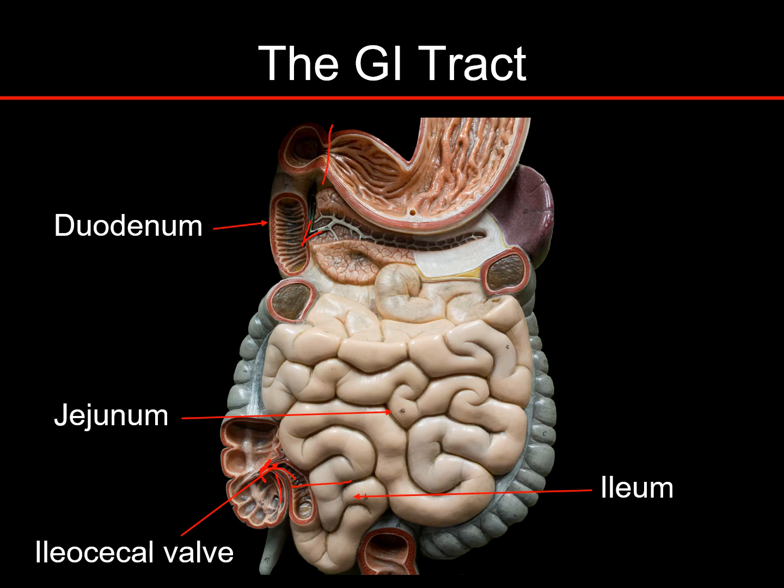Okay, so here's the cecum here, and that's the first part of the large intestine. And that's where in other animals, especially herbivores, they have a very pronounced cecum, and that's where a lot of their fermenting happens because they have a lot of microbes in there and they can digest that fiber way better than we can. But we do have a cecum, so we are able to digest a little bit of fiber. We do have microbes in our large intestine that help us to do that. So we do have a cecum. And then here's the appendix kind of shooting off the end of that cecum there.